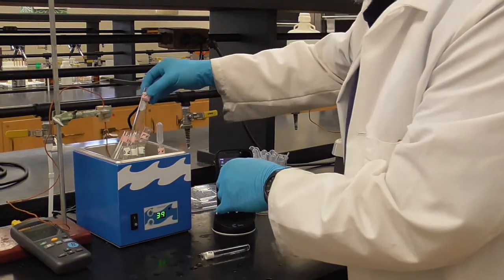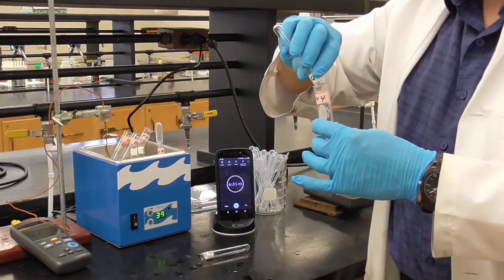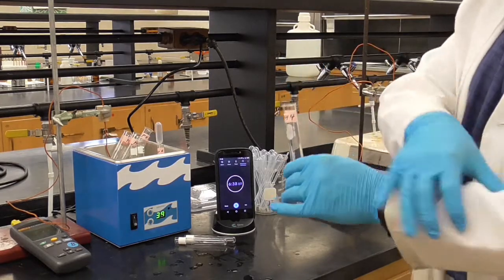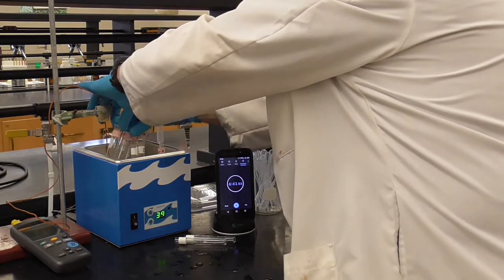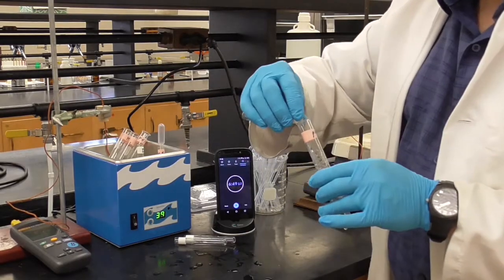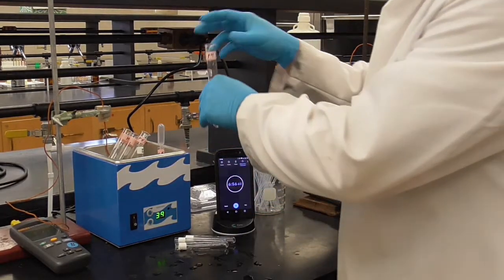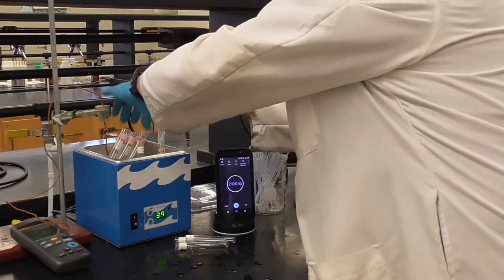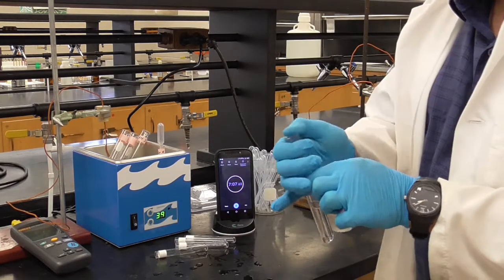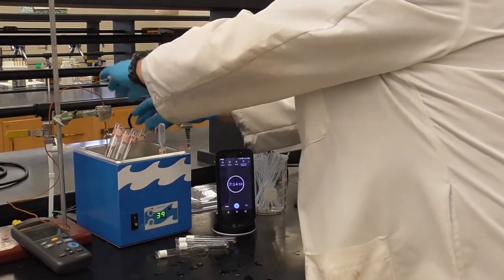And we'll just go ahead and do that for each of our tubes. Here's the pH 4. Add the starch. Give it a mix. Okay. pH 7. Okay. And pH 10. Okay, so we've got our amylase, our starch, at the different pHs.